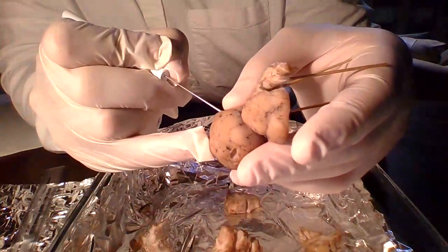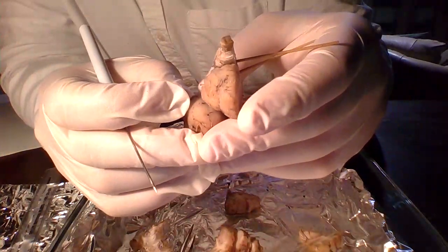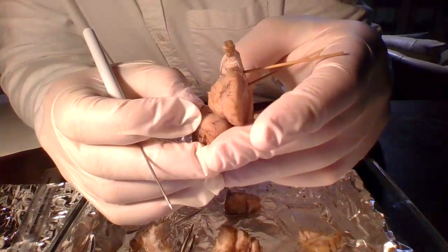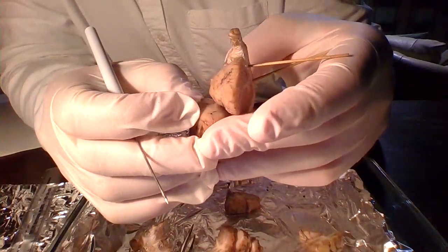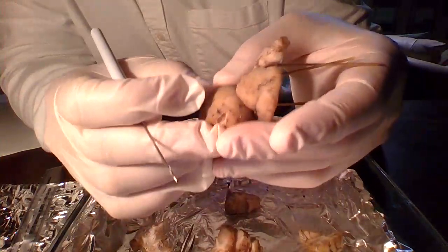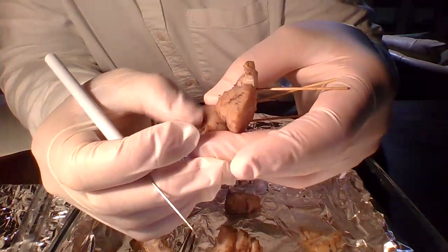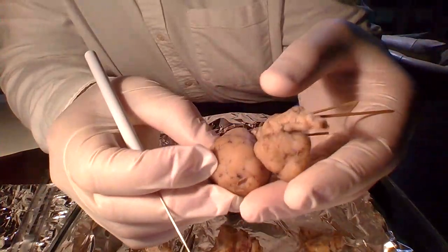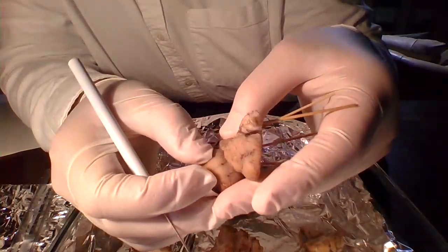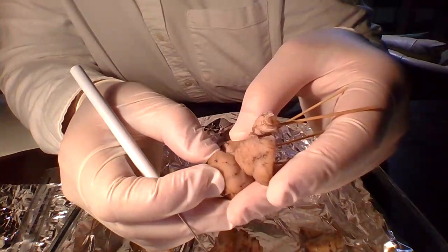See if I can just keep on teasing this apart. Yep. So if you find a sulci, you can kind of just pull it. Unlike if you were at this gyre right here, you can't pull anything apart. And these sulci go deep.